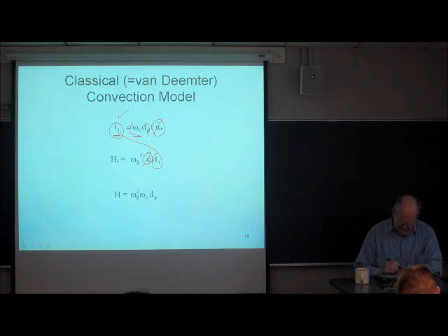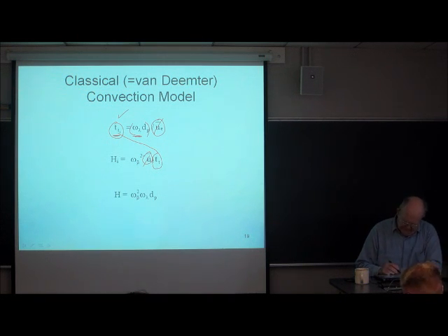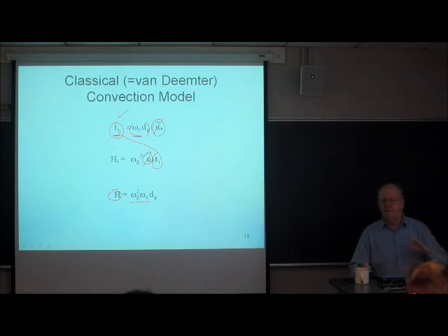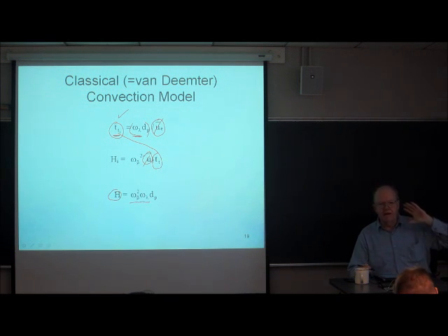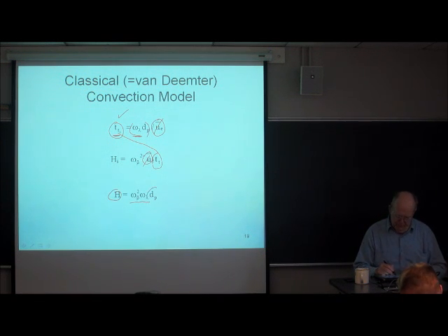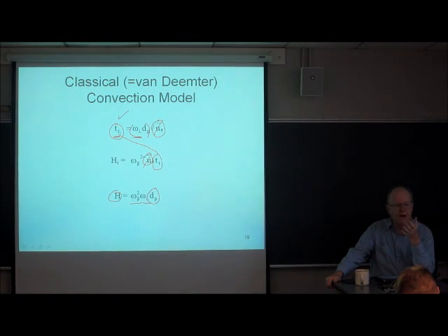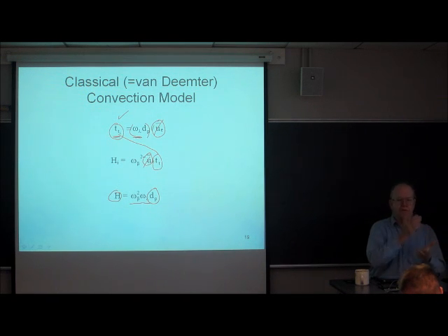They compensated one another. So when I combine all the constants of proportionality, I come up with an HETP that's equal to some constant, which I don't know the value of. I'm going to have to get it empirically. But the HETP is proportional to the particle diameter, to the first power. So if you double the particle diameter, the HETP for this term will double.